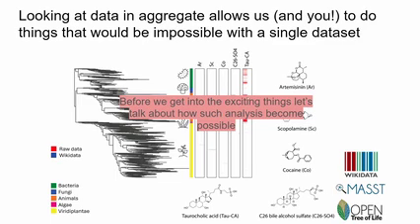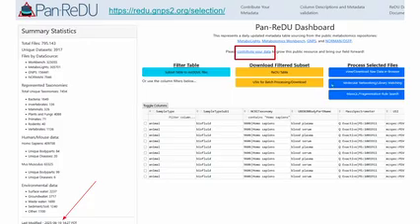And these more boring things is, how is this even possible? How can we make these types of analysis, and how can you also make this kind of analysis? How did this become possible? And this is probably one of the more important buttons here, which is contribute your data, because all of this data that you have just seen now in this tree that was displayed, and all the data that you will look at later together with the others are public raw data.